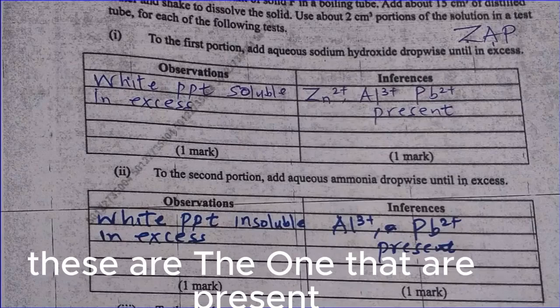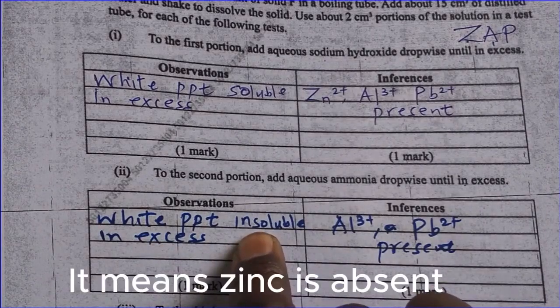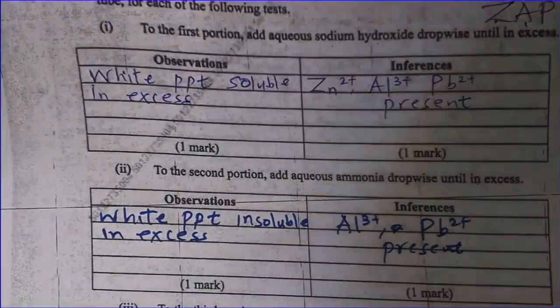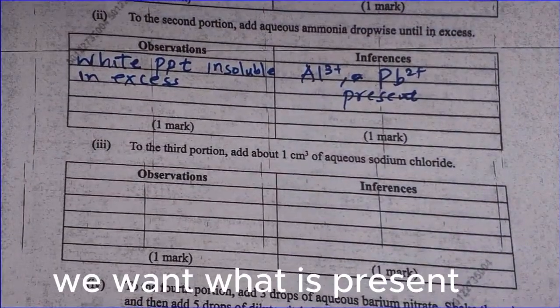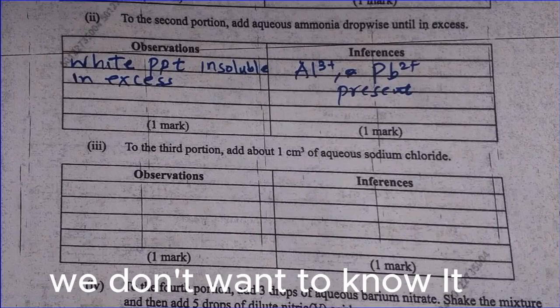These are the ones that are present because when it is insoluble, it means zinc is absent. So don't write zinc absent because we do not want negative answers. We don't want what is not available. Whatever is absent, we don't want to know it.